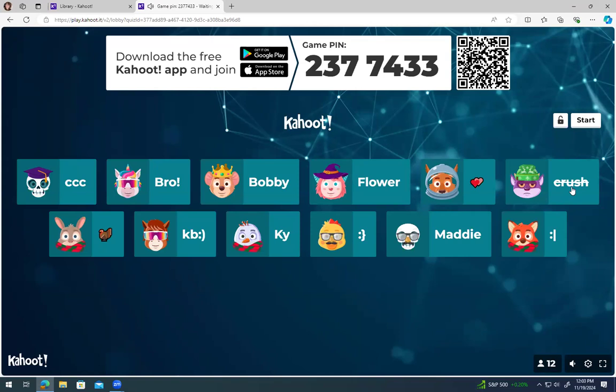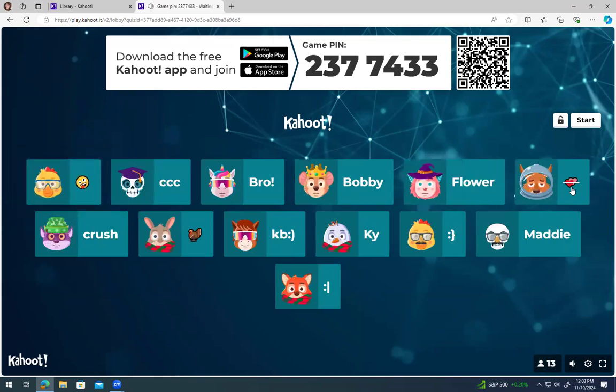Okay, so that is our litmus chart, if you will. Also, if you have coagulation, we could have gas. That is a possible result; we didn't have any tubes that did that, but it is a possible thing. You would see bubbles or cracks in the media if that was the case. I like this better than the charts, like the tables, I mean. That helps me visualize what's actually happening. All right, so let's get going.